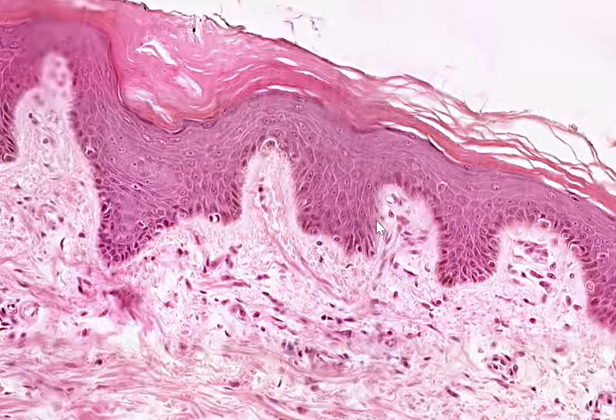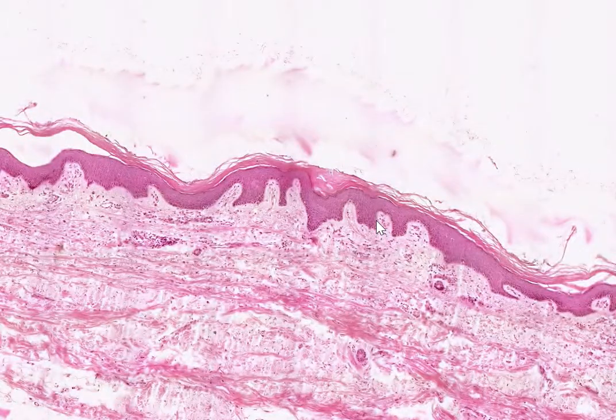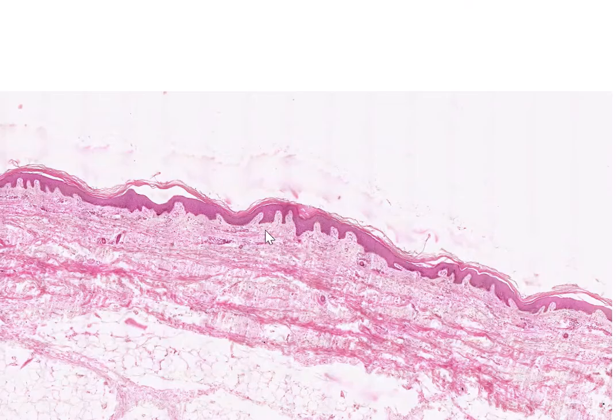This is thin skin. Thin skin means that we have skin. Skin consists of epidermis, dermis, and subcutis, 3 layers. Skin where the stratum corneum, the uppermost layer of the epidermis, the layer that does not contain any nuclei, is thinner than the rest of the epidermis here.